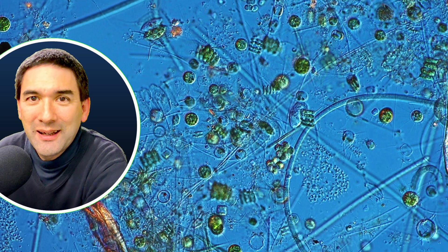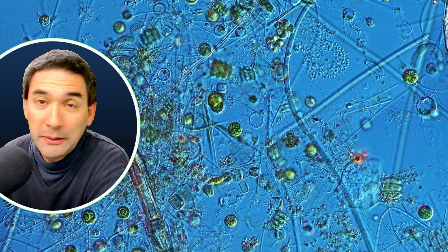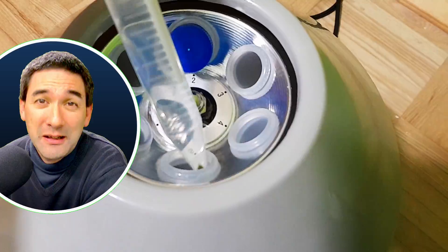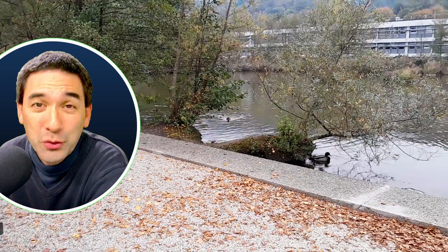Hi, hello, welcome again. I think this is really beautiful here. These are algae and plenty of other stuff. Diatoms I found as well. Not so many of them, but a lot of cyanobacteria. And I extracted those by using a centrifuge. And this is actually what I would like to show you today.